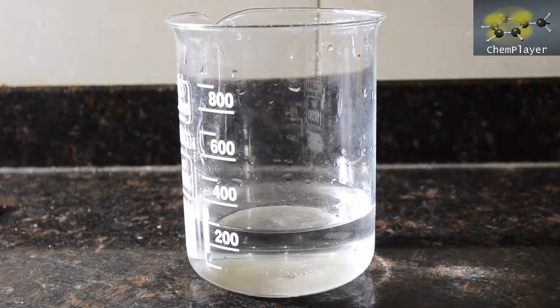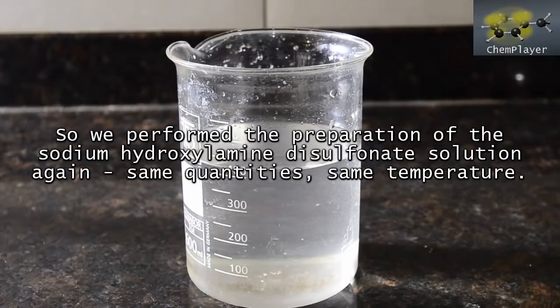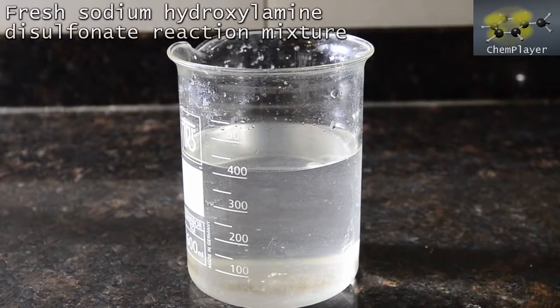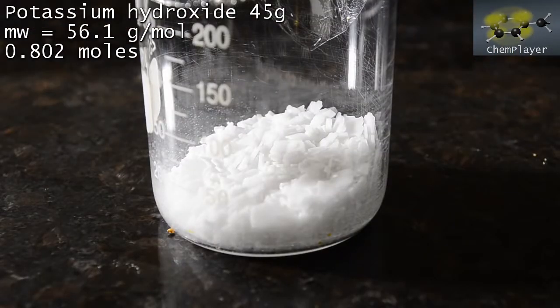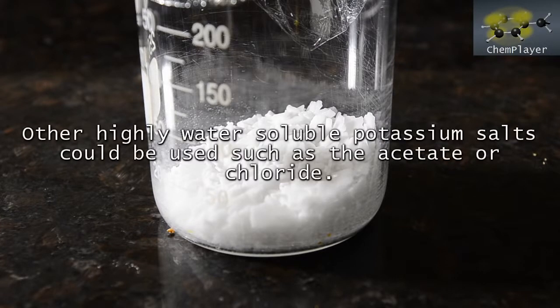So we saved this distillate and started over with the reaction, following exactly the same process and creating the new reaction mixture from the sodium nitrite and bisulfite reaction at below 0 degrees. Here it is. This time we're going to try converting the sodium hydroxylamine intermediate into the potassium salt. So here we've weighed out 45 grams of potassium hydroxide. In theory the potassium ions should allow the potassium salt to crystallize out of the solution.